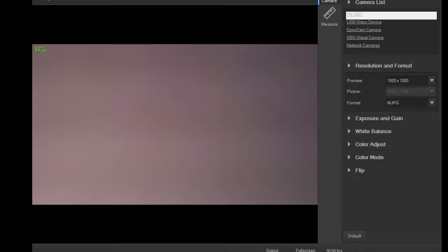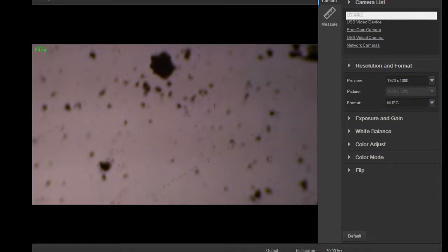I'm going to try the other tube now. Now I'm curious to see how much better that other puddle was. Or gutter. The first one was a gutter, I think. This is the actual puddles. So, should be a little bit different potentially. Okay. A little cover slip there. Come on. Alright, let's see what's on this guy. Let's see what's on this one.